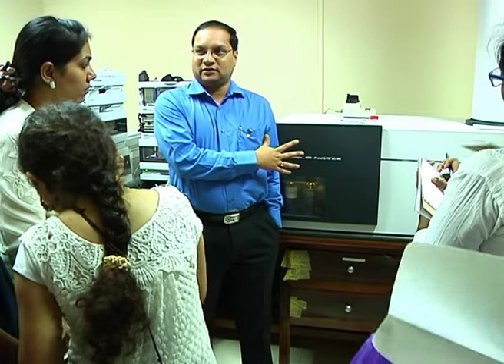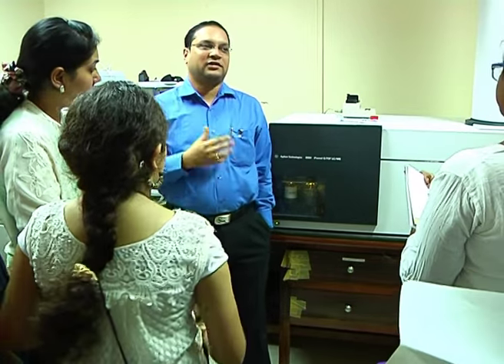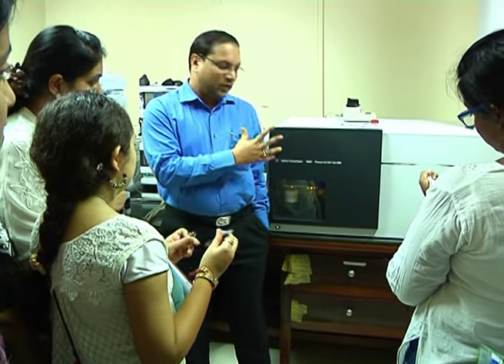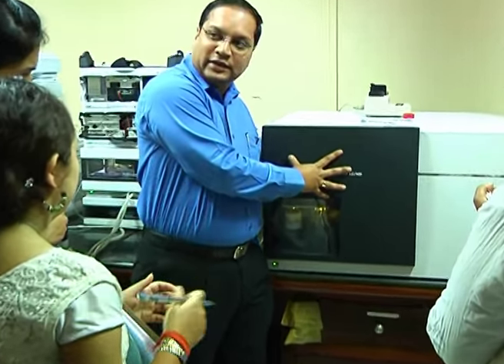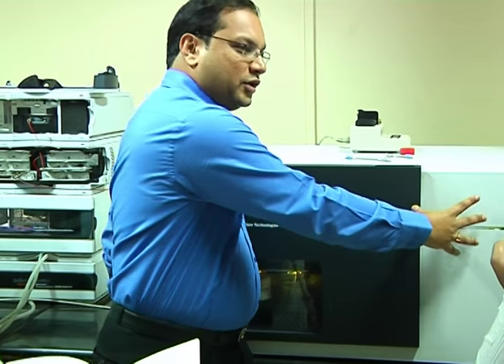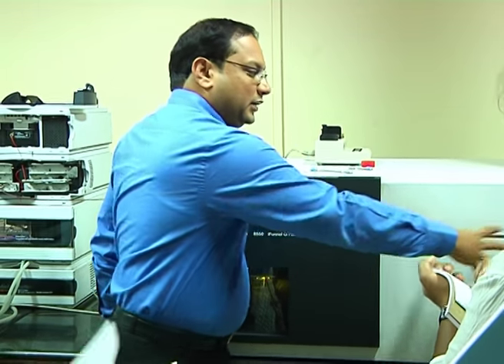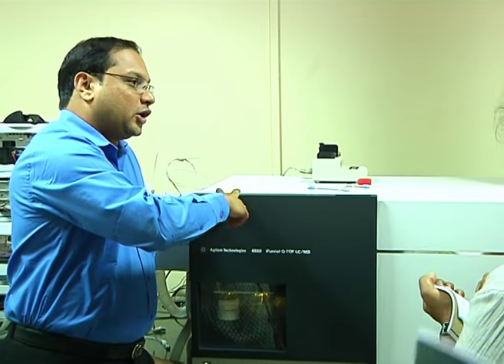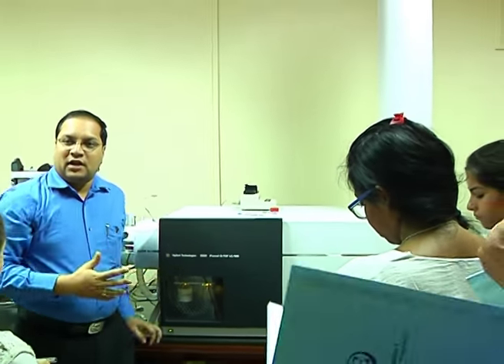This is the instrument, something like what we have seen in the schematics, a quadrupole time of flight type of instrument. There you have the quadrupole, as I showed you in the presentation. Then you have the collision cell, okay, and then we have a time of flight. So the quadrupole and time of flight are in tandem.